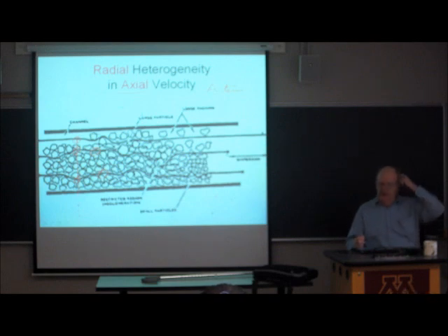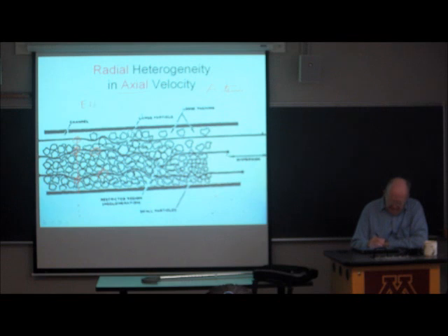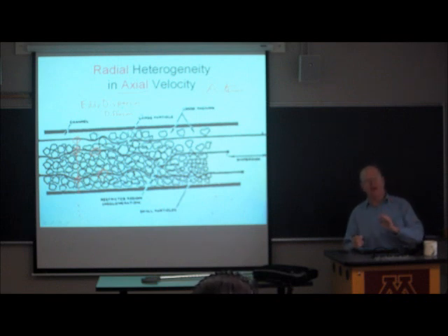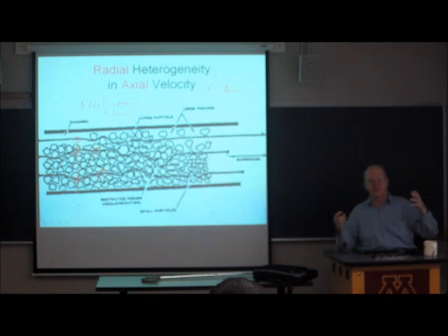This process has a lot of different names. It depends on which literature you're reading. The most common name you'll see for it is eddy dispersion or eddy diffusion. I actually hate this second one because it makes it seem like it's a diffusive process, but it's not a diffusive process. It's a dispersive process that acts like diffusion. Diffusion causes things to spread out. Dispersion also causes things to spread out.